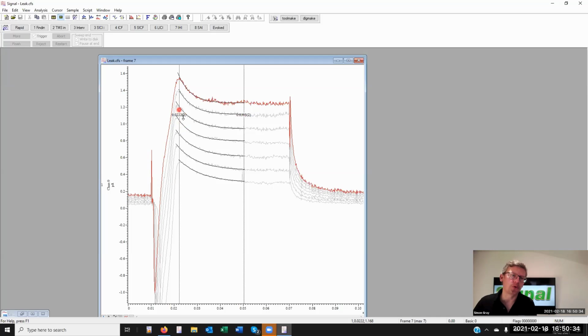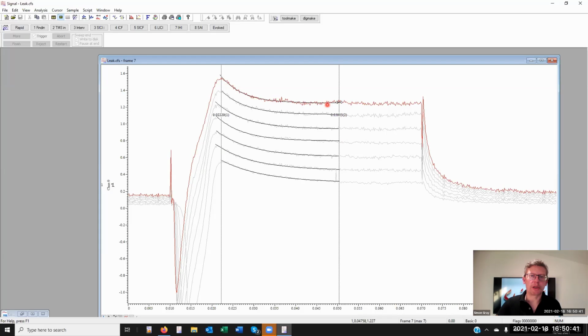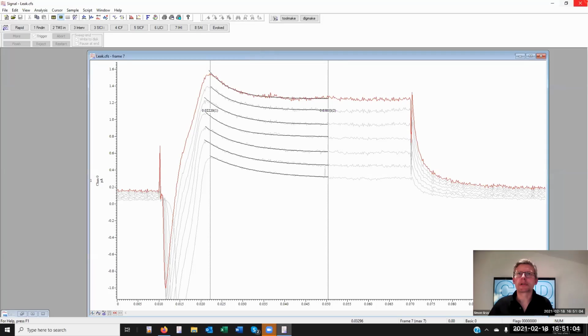Now, the frames are overdrawn here. And the reason I did that was so that I can show you that when we do a fit between those two cursors, the fits will change their length according to the various movements of these two cursors. So cursor one moving left and right, finding the new peaks, you can see that the drawn fit range is different in this setup.